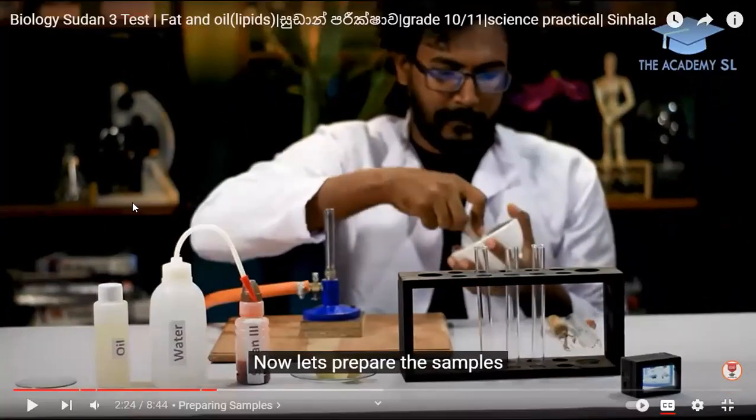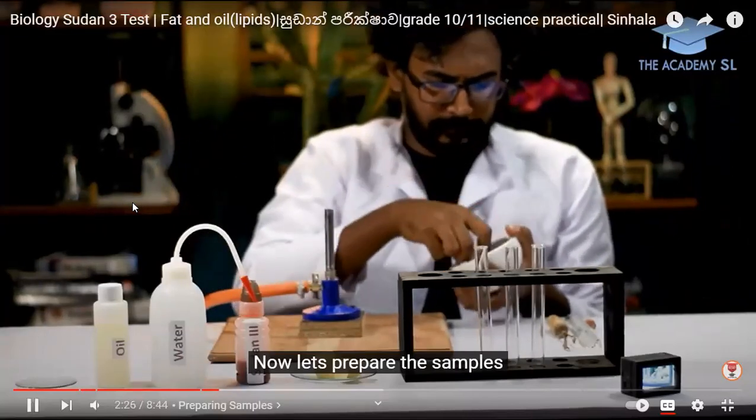He is testing for any food item having lipid. We'll see.